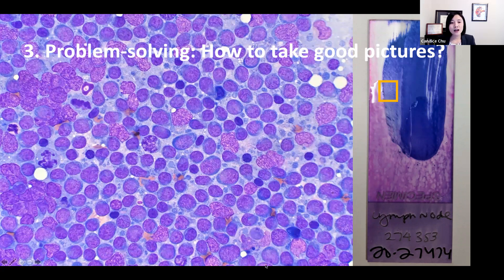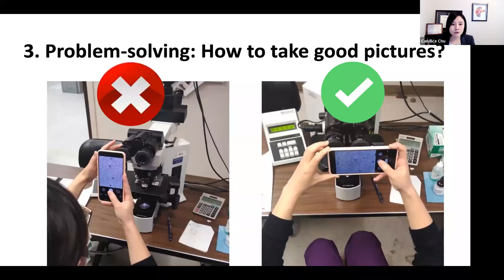So once they learn where to look at the cytology smear, then I teach them how to take good pictures. I teach them it is very important to do it horizontally. Don't do it vertically because that's usually more difficult.